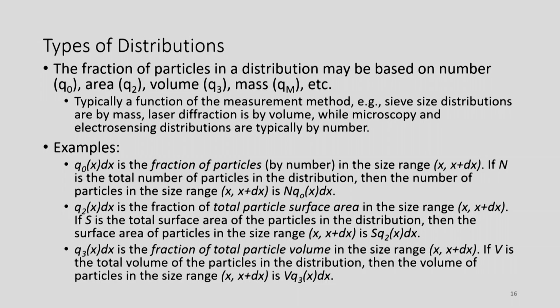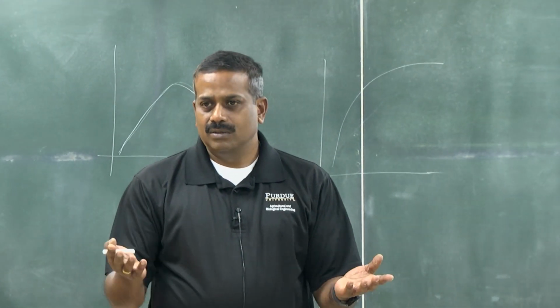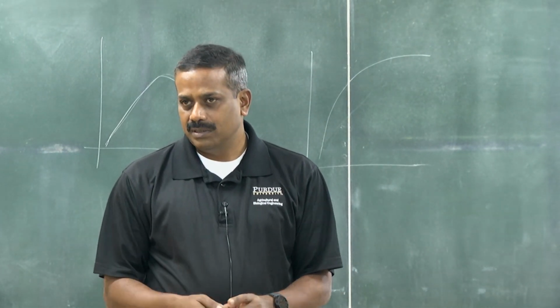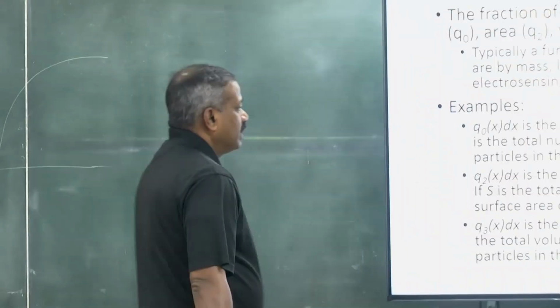Someone said air jet classifying yesterday, right? So that's some of the principle that we use when we classify powders. At least a couple of you are working on protein separation, right? So that's one common principle that we use for those classifications, based on size. And if you know the distribution, you can classify them, okay.